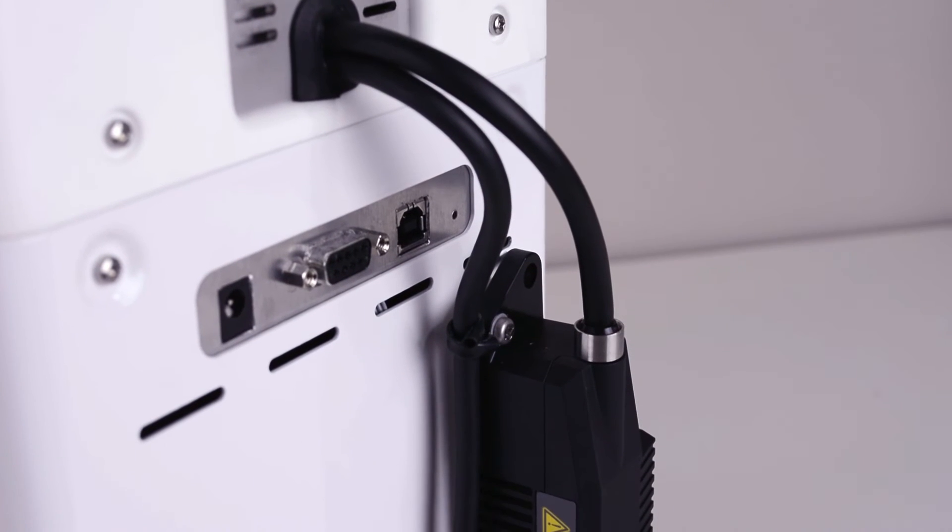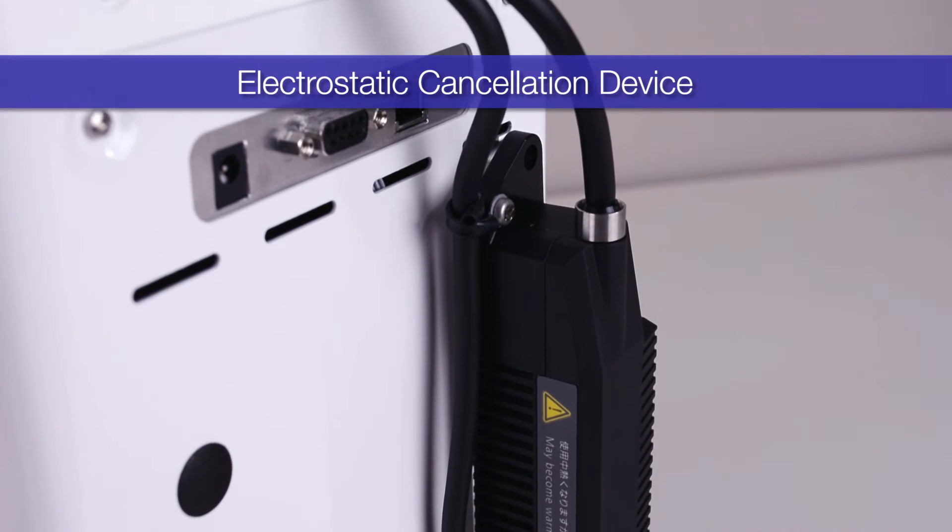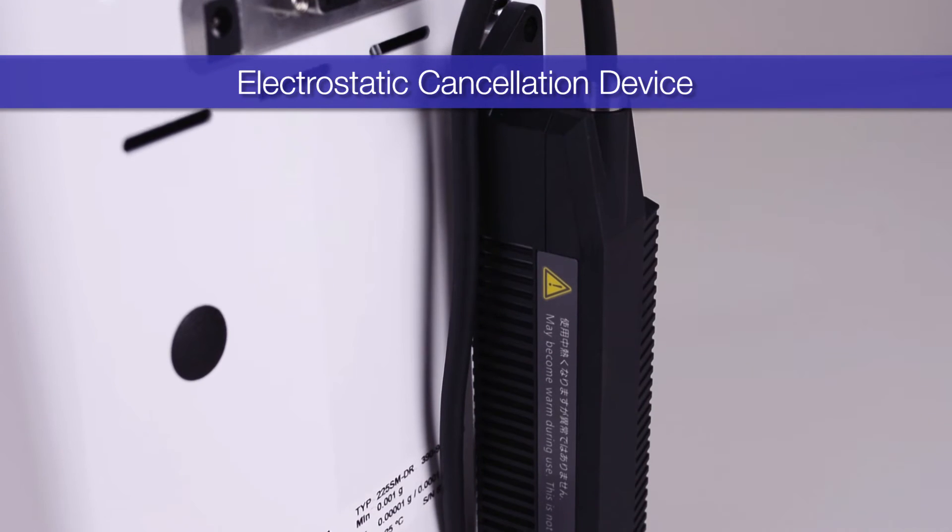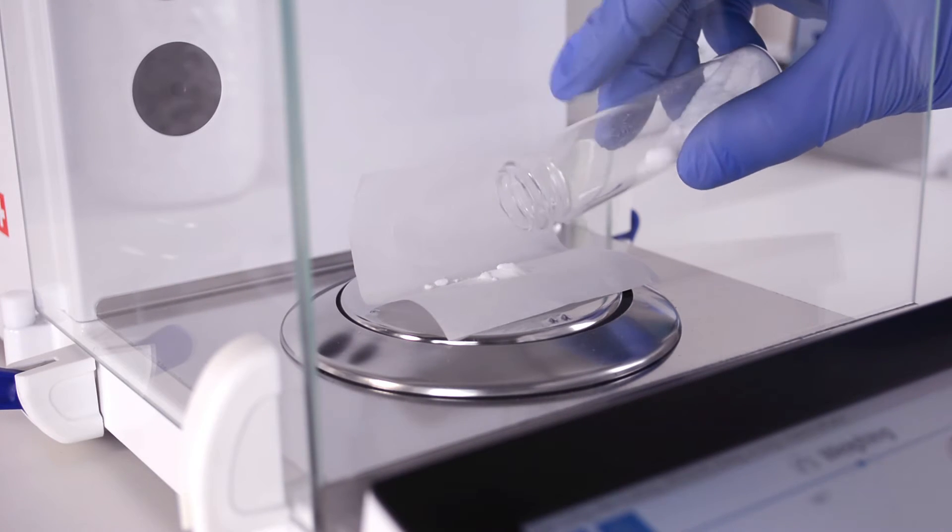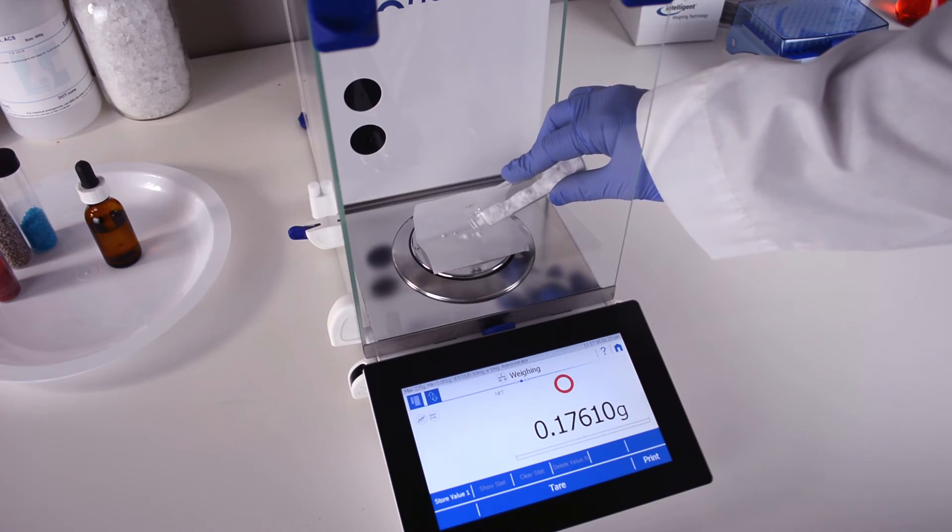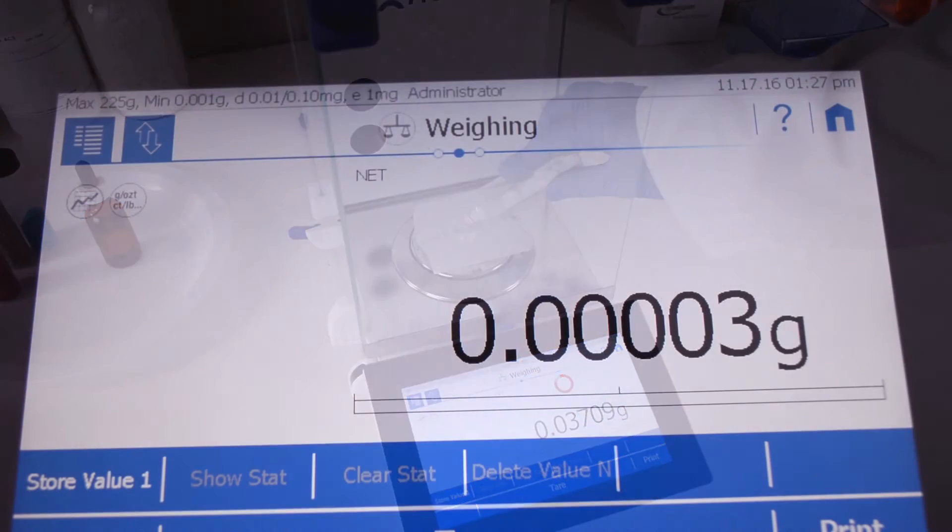As an option, an electrostatic cancellation device can be installed onto the balance, removing static electricity buildup from the weighing chamber which can cause inaccuracies in weighing and can make powder samples difficult to handle. The balance will notify you when the electrostatic cancellation device is operating.